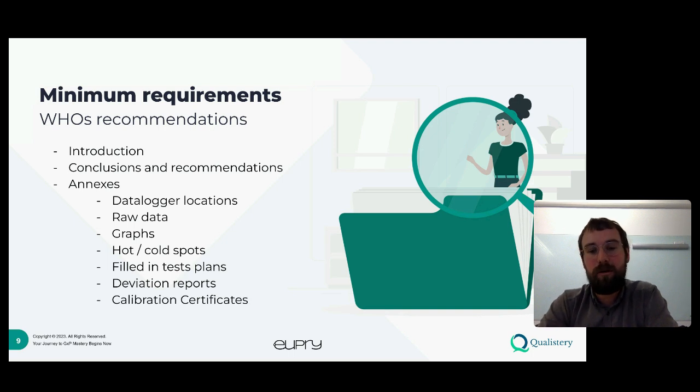And lastly, sort of a more technical matter, you should have your calibration certificates. And we'll go much more into detail as to why that is important.